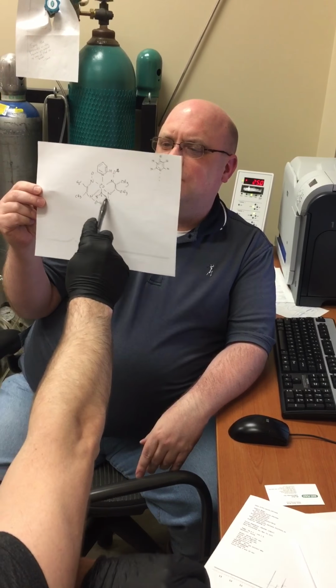Okay. So we have now identified all but one set of hydrogens. The only thing we have left are the methyl groups here. What should they look like? Well, split by one hydrogen, they should be a doublet. There's your doublet, about 0.9-ish.